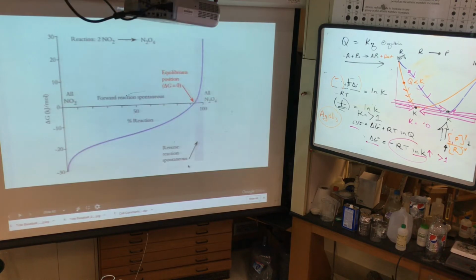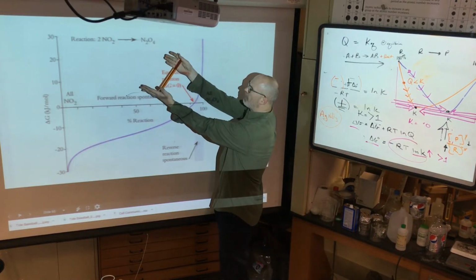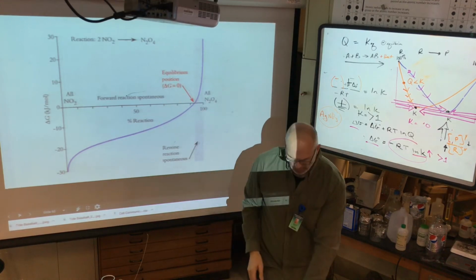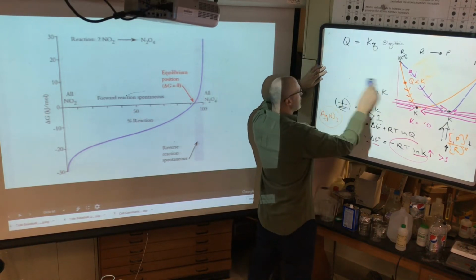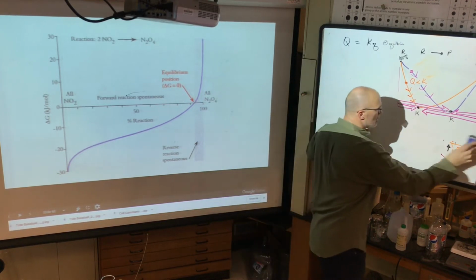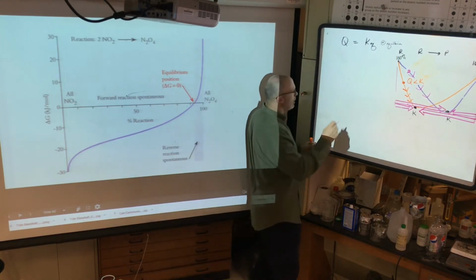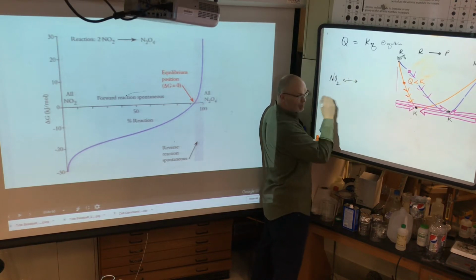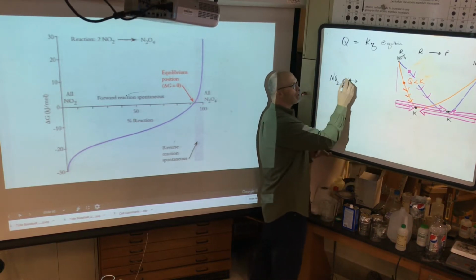All right, party people. I've got for you today an ampule. This is an ampule of NO2 and N2O4. Okay? Let's get rid of the stuff on here. Now, what's in this ampule? Two gases. Those gases must be in equilibrium, correct? So what do we got? We've got NO2 in equilibrium. It's not a K value that's so extreme, so it's not a completion reaction, N2O4.